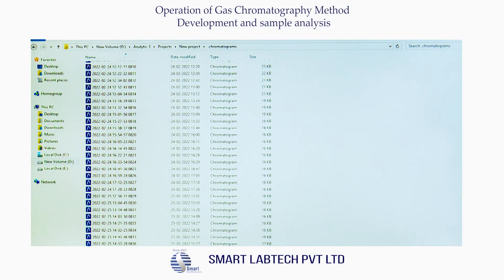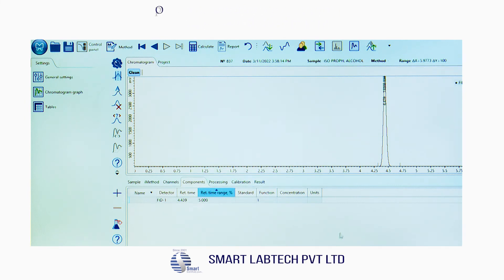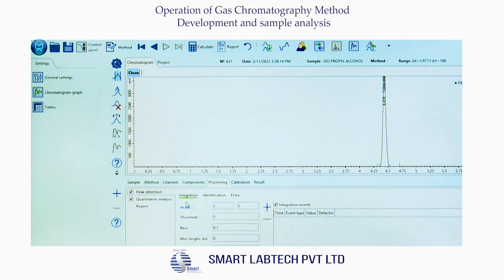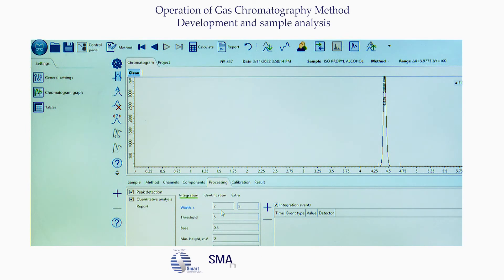Now go to the path where chromatograms are stored and click the chromatogram — the IPA chromatogram appears on the screen. Now perform peak integration by selecting the Processing tab. Tick on peak detection and quantitative analysis. In peak detection, under the integration tab, select width as 2.5, threshold as 5, and base as 0.5.